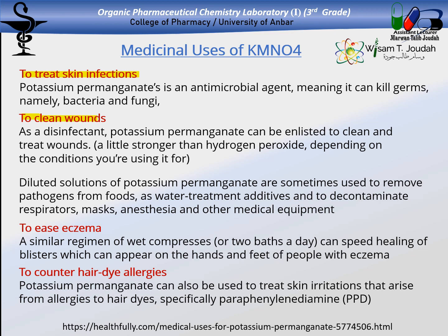The diluted solutions of potassium permanganate are sometimes used to remove pathogens from foods, as a water treatment additive, and to decontaminate anything that causes contamination.